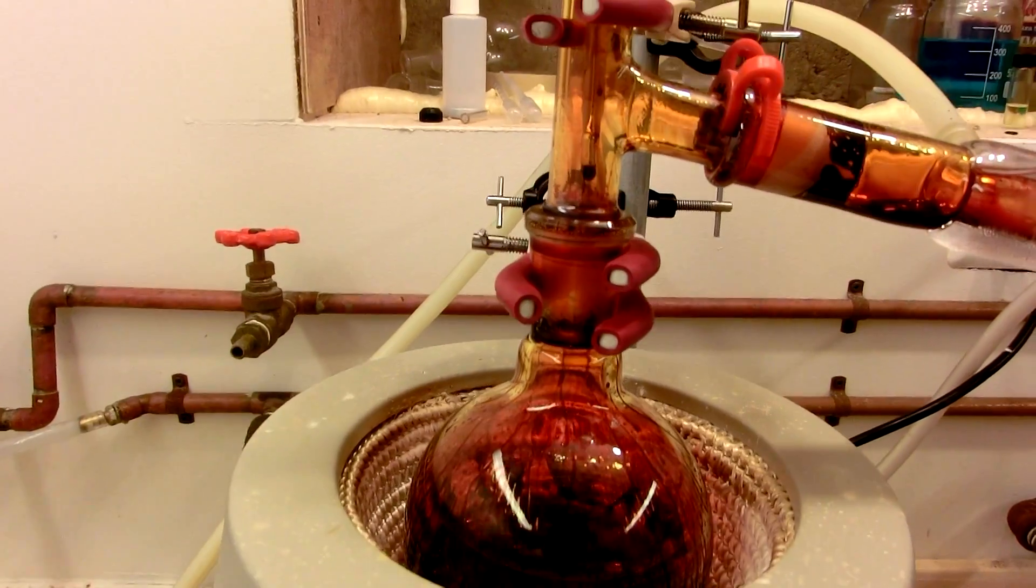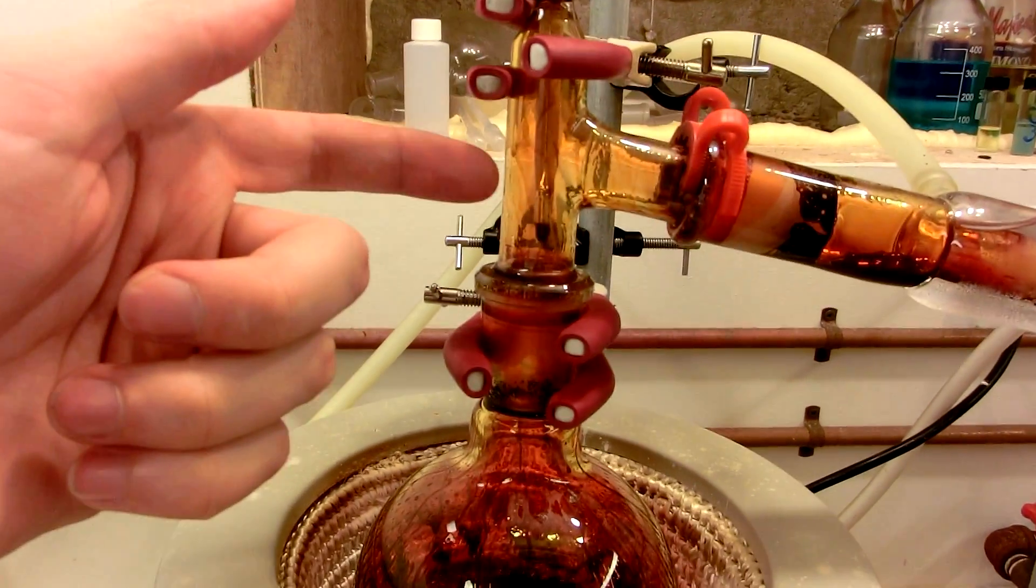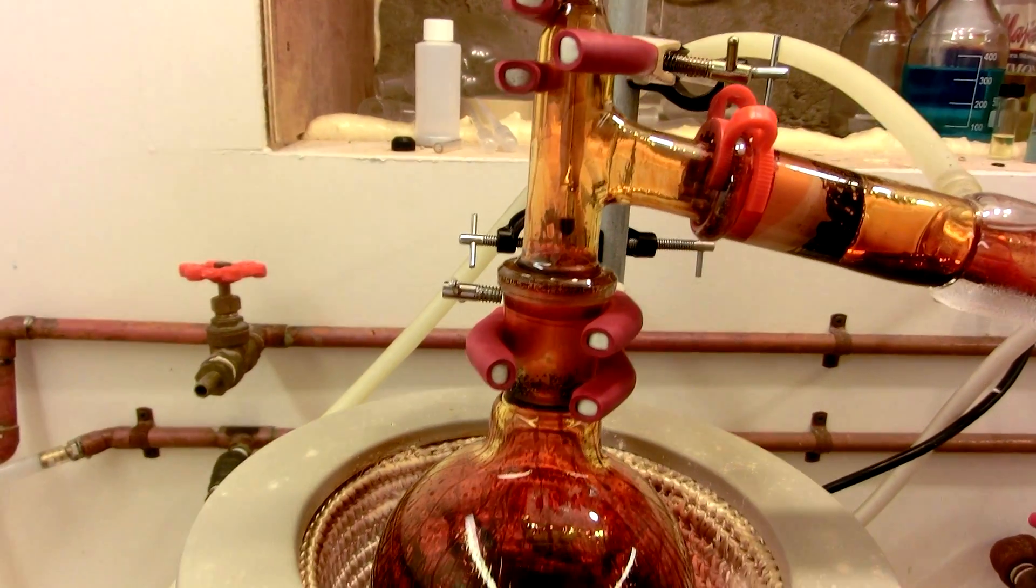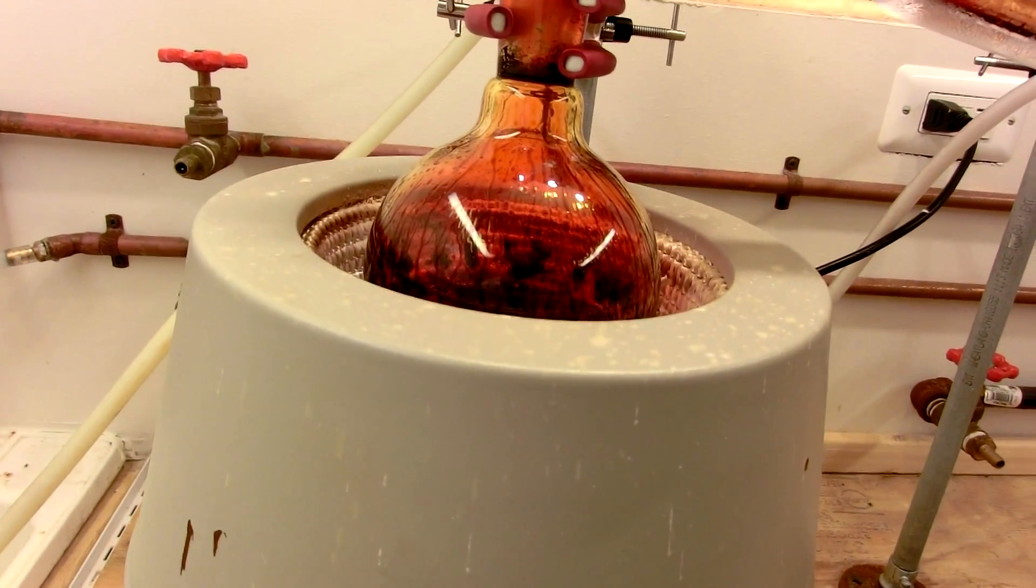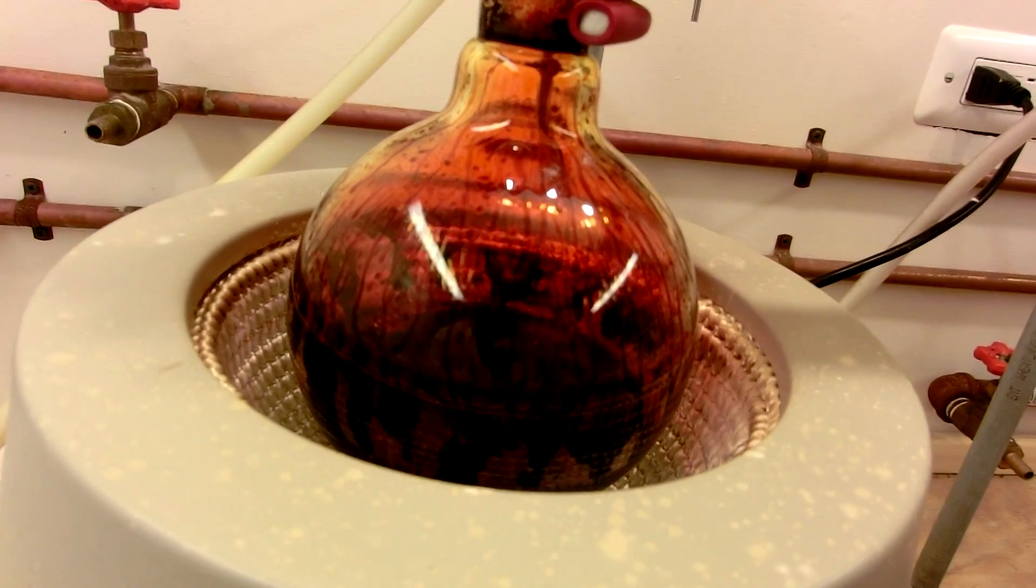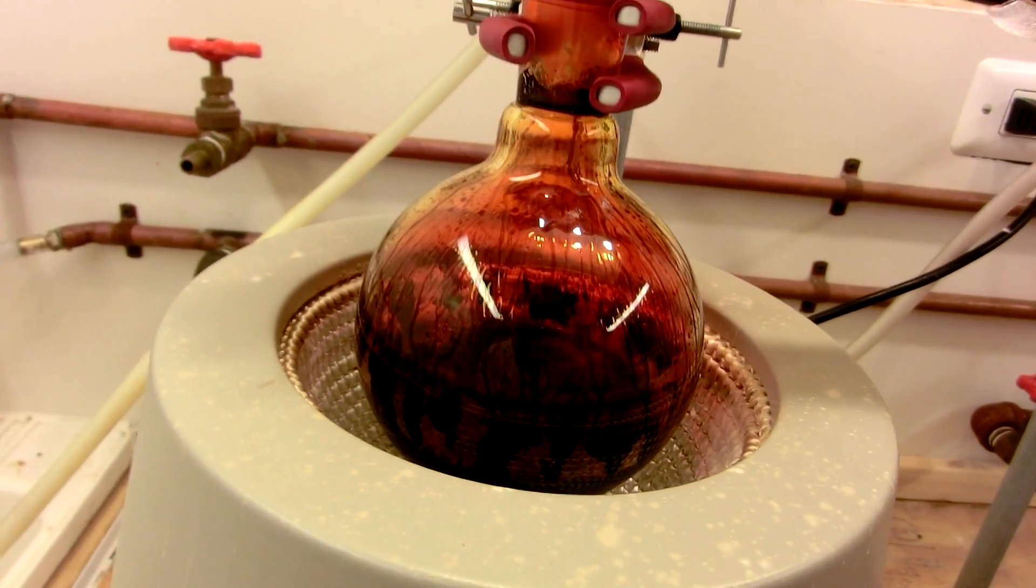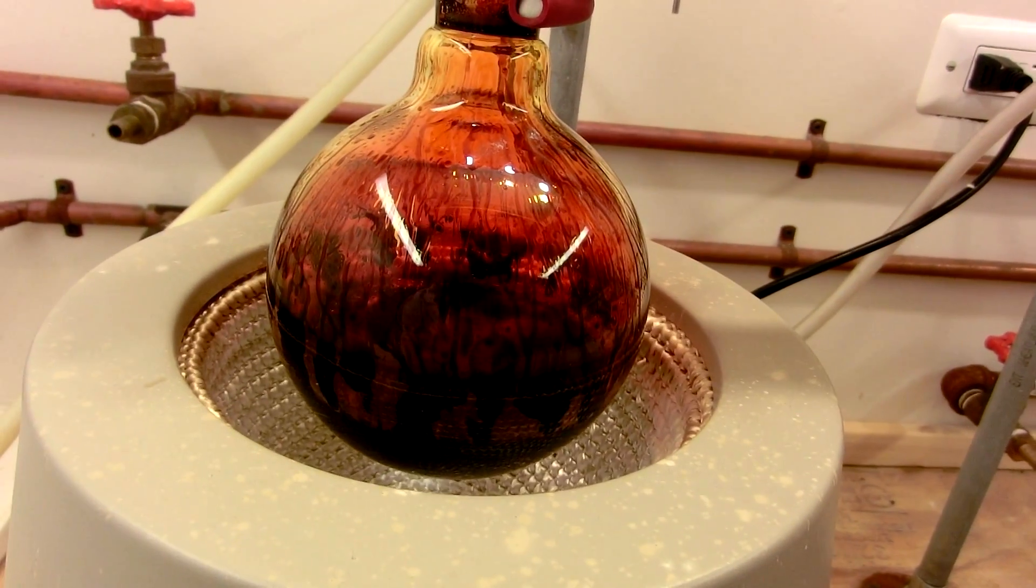The end point of the reaction will be evidenced by a sudden clearing of the glassware. Notice how this has gone from a very blood red to a lighter color. The heating can then be stopped. We'll lower the heating mantle to prevent it from scorching the contents of the flask or driving any water off the sulfuric acid and contaminating our chromal chloride.